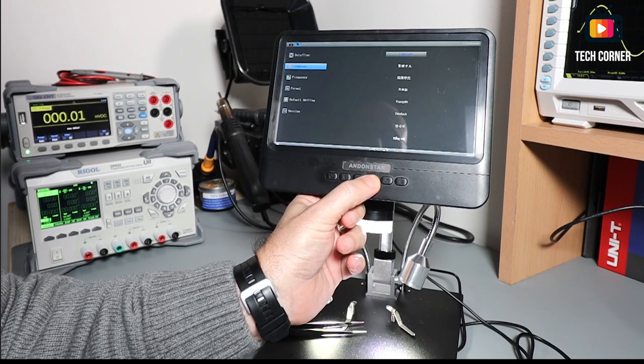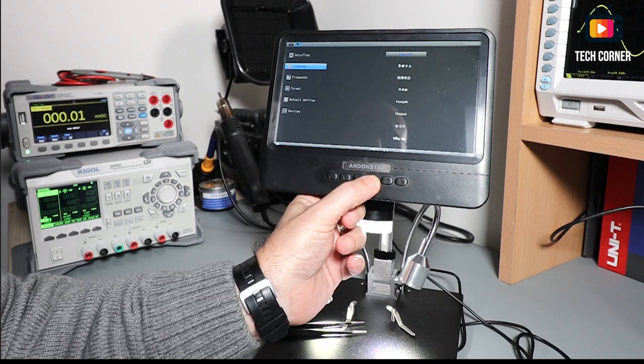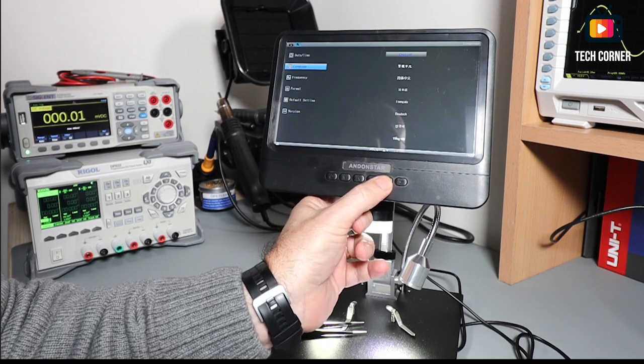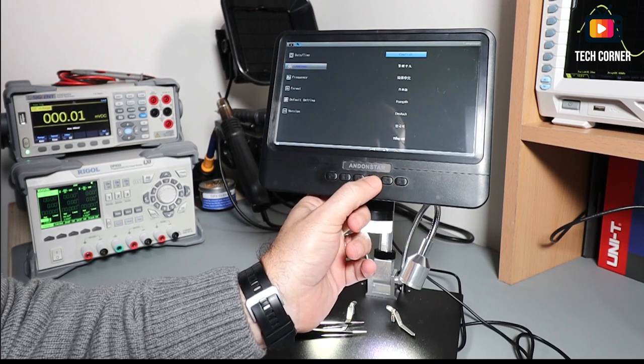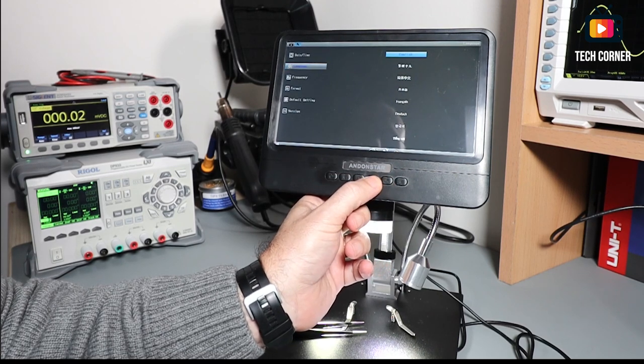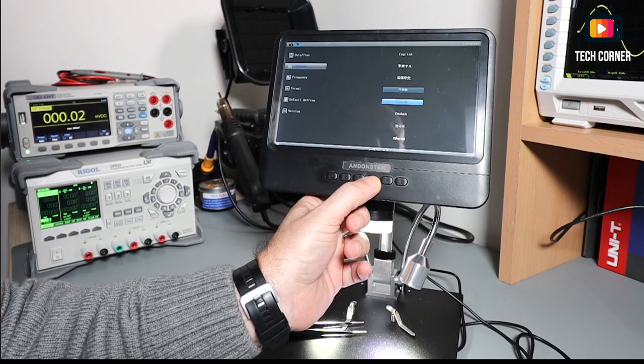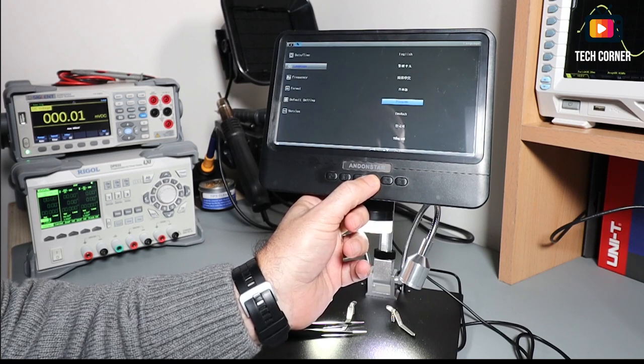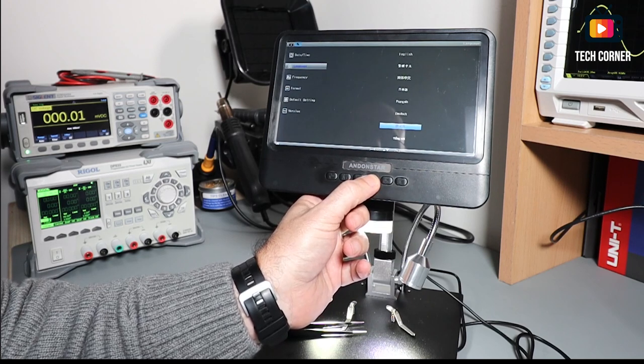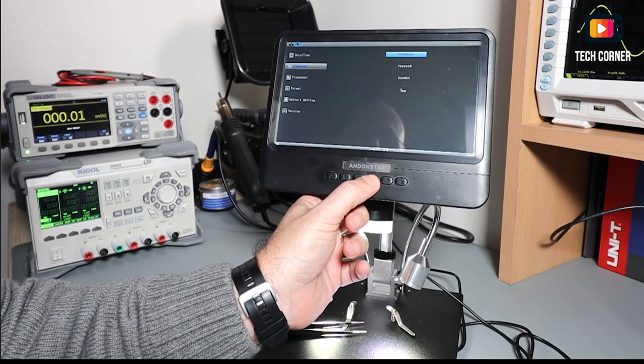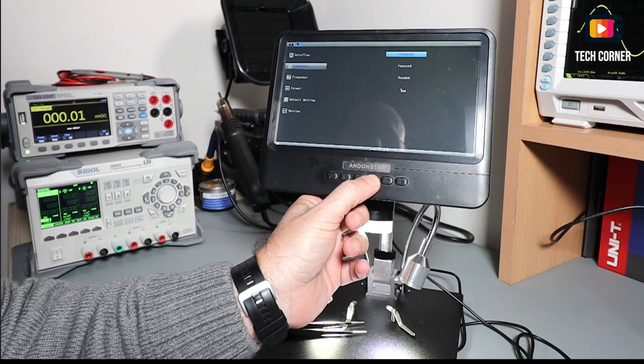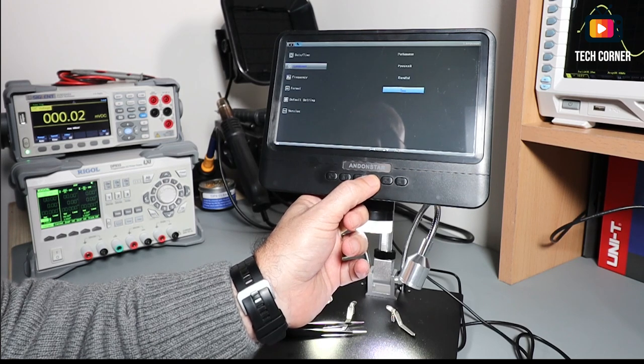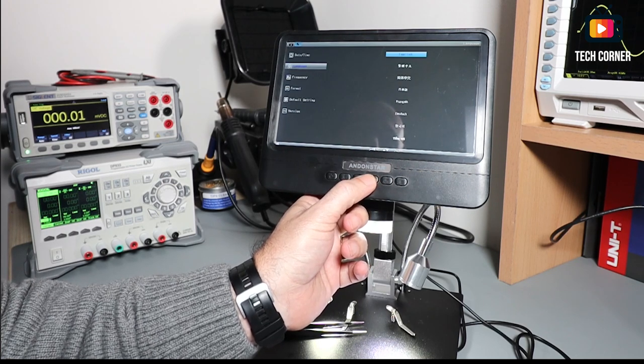We can choose the language. We have several languages available. I believe that's Chinese and Japanese, French, Portuguese, Spanish and so on.